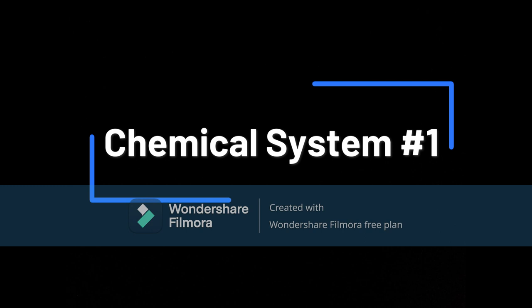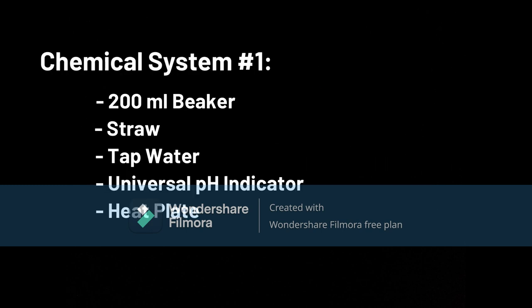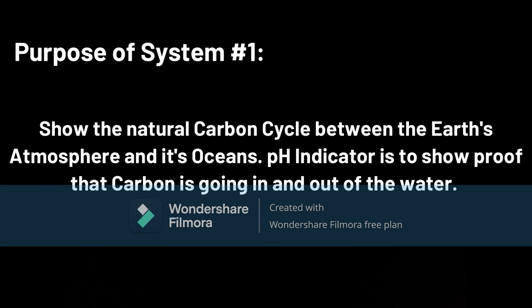Chemical System 1. This system includes a 200 milliliter beaker, straw, tap water, universal pH indicator, and a heat plate. The purpose of the system is to show the natural carbon cycle between the Earth's atmosphere and its oceans. The pH is to show proof that carbon is going in and out of the water.